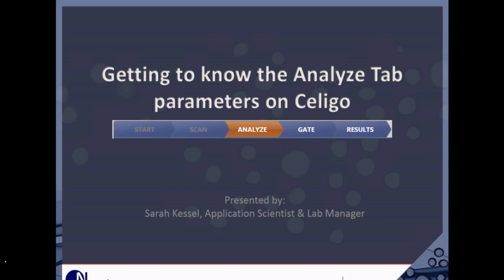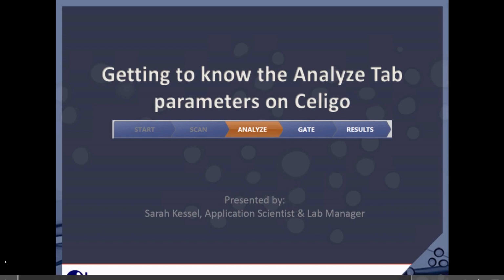Hey, this is a great webinar. If you're just learning how to work with the Celigo, the Analyze tab can be a little bit daunting because it's image analysis parameters. And so that's why we're holding this special webinar for this topic. It'll help you understand the details of how your image is actually being analyzed. So hopefully at the end of this, you'll have a little bit more clarity and understanding of how to set up the parameters in the Analyze tab.